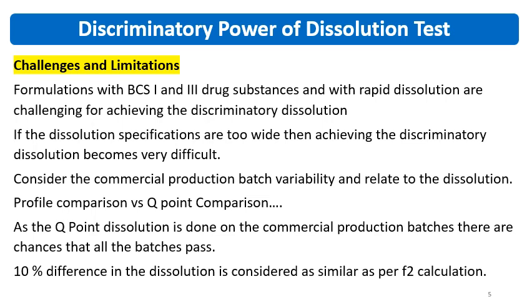For IR formulation specifically, there will be a Q point and it is a chance that in Q point all the batches will pass.